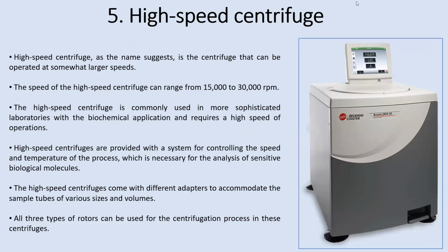This is also commonly seen in the research laboratories, which is known as a high-speed centrifuge. So benchtop and high-speed centrifuges are there in the research laboratories. Because sometimes if you are working again with not much larger volumes, but still considerably larger volumes, this is a good high-speed centrifuge. And it is kept on the floor, so it requires a certain dedicated area where it is kept.